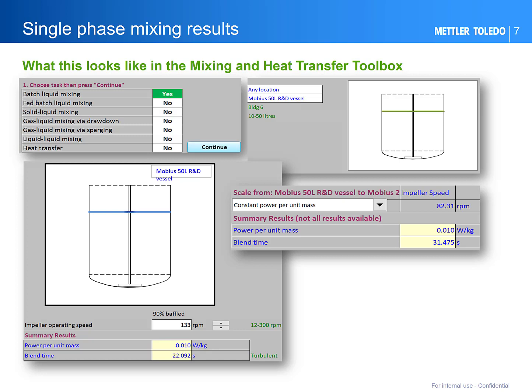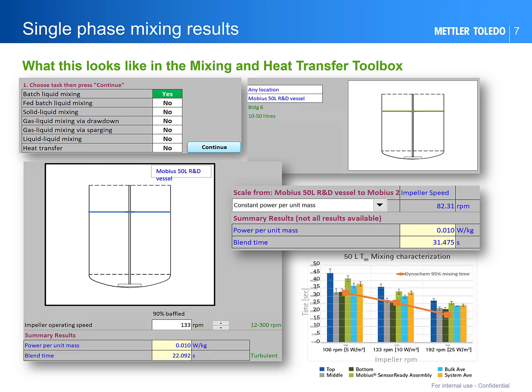All parameters in the utility come from literature data and we like to compare these to measured data wherever possible. This plot shows the mixing time in a 50-litre bioreactor — the orange line shows the predictions compared to the measurements over a range of speeds.